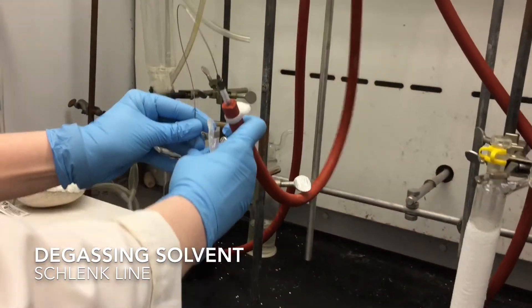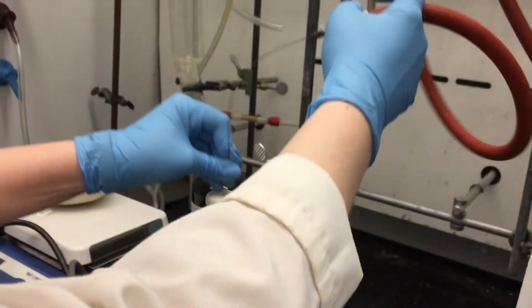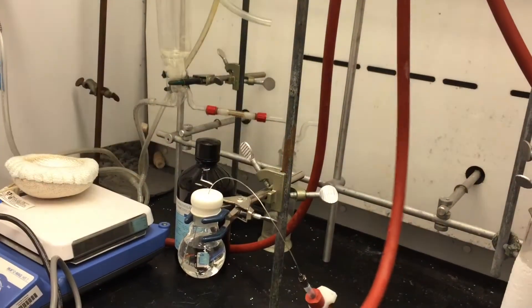The next thing I'm going to do is put the needle into my solution. You want to make sure that the needle goes all the way into your solution. Now, right now, this is still a closed system, so you're actually not going to get any bubbling.